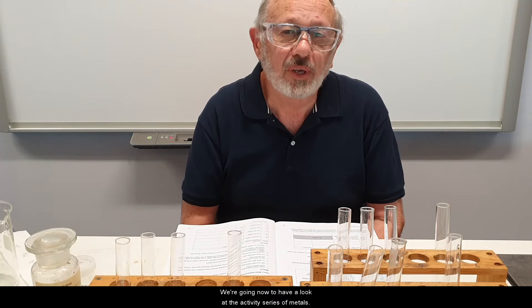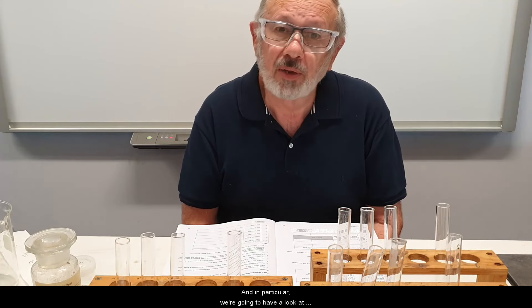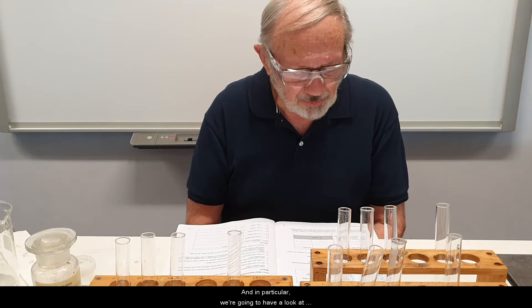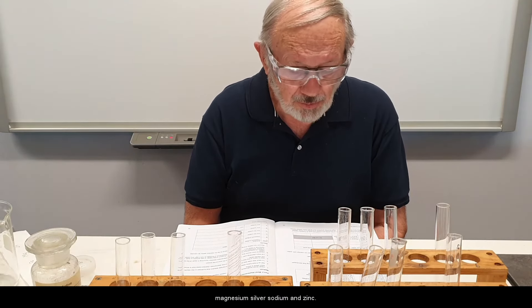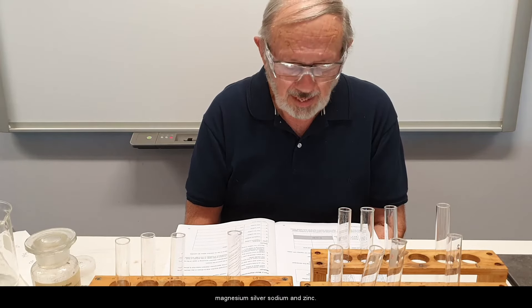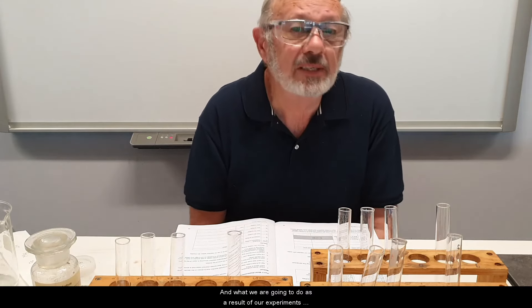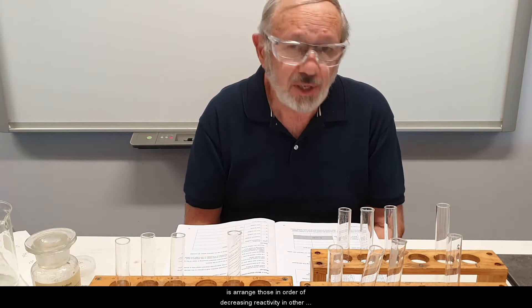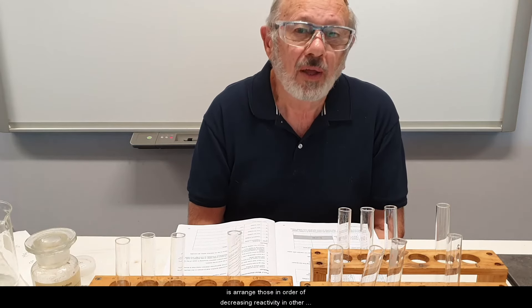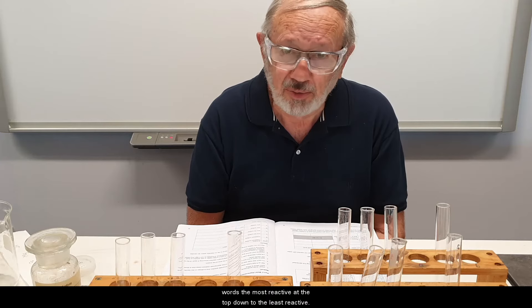We're going to have a look at the activity series of metals, and in particular we're going to look at the metals copper, iron, magnesium, silver, sodium, and zinc. What we're going to do as a result of our experiments is arrange those in order of decreasing reactivity — in other words, the most reactive at the top down to the least reactive.